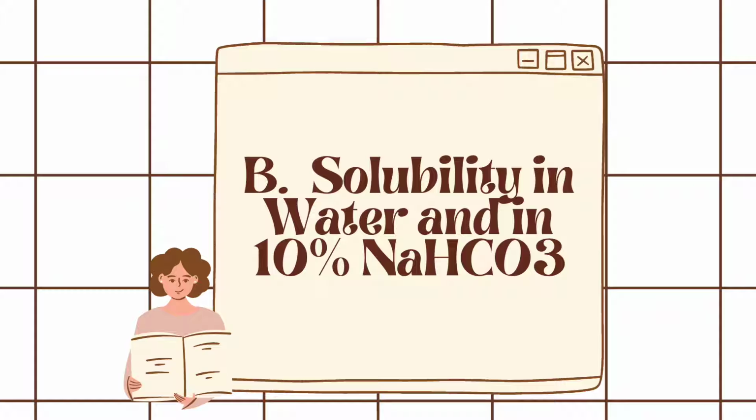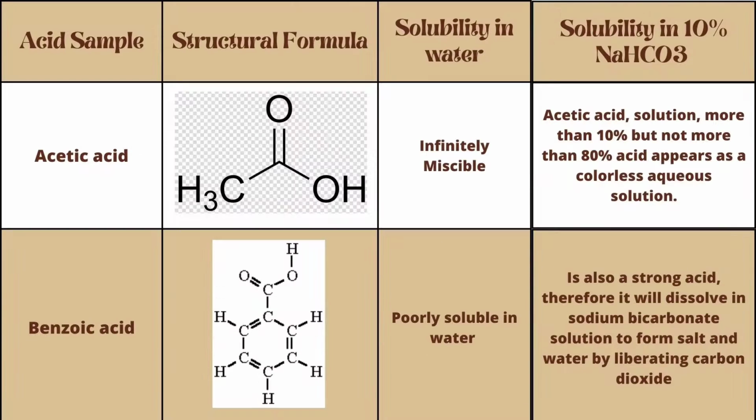Good morning, classmates. Letter B, solubility in water and in 10% NaHCO3. Acid sample: acetic acid, structural formula. Solubility in water: infinitely miscible. Solubility in 10% NaHCO3: acetic acid solution more than 10% but not more than 80% acid appears as a colorless aqueous solution.